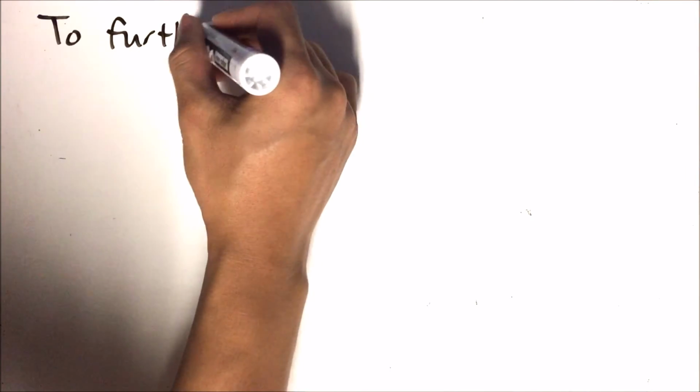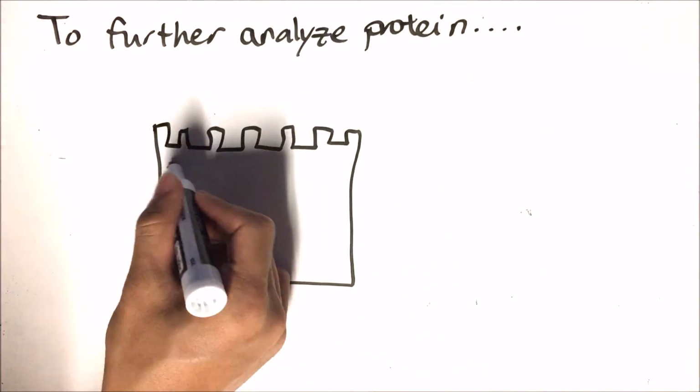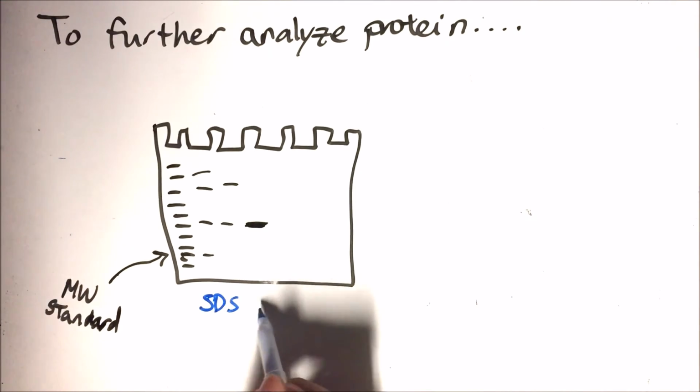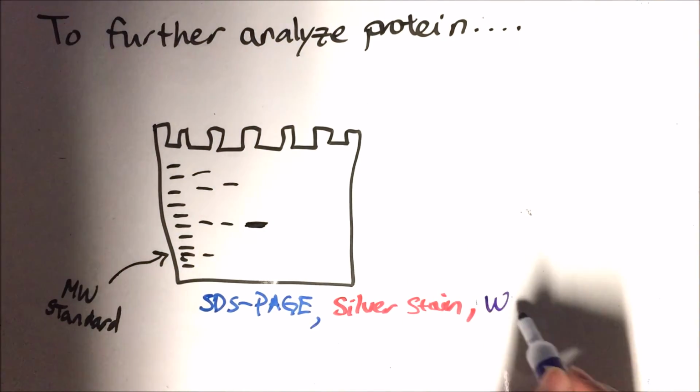In addition to this, we can also measure our protein purity using SDS-PAGE. We can visualize our gel using methods like silver staining, Western blotting, and immunoblotting. Based off of their standards, these methods give us the molecular weights of the proteins in each purification step. As the mixture becomes more pure, we should see higher quality bands of our protein.